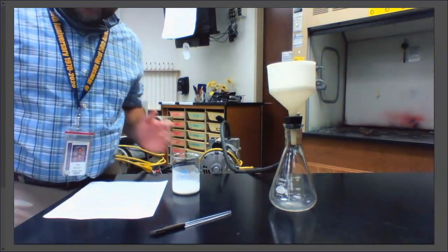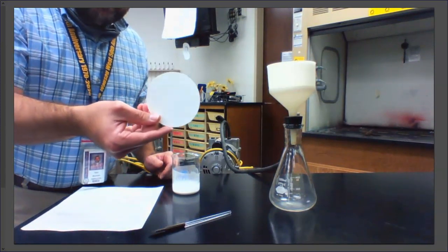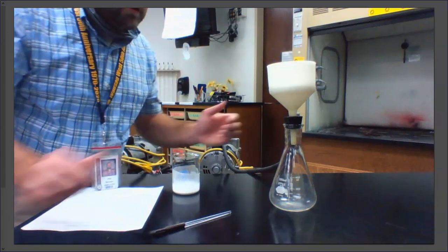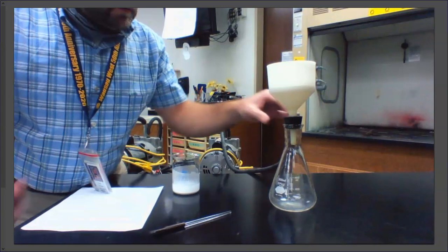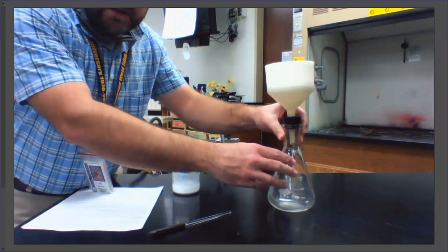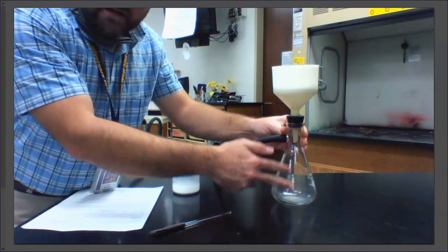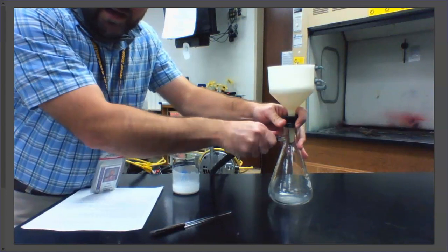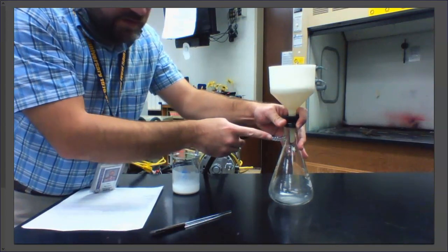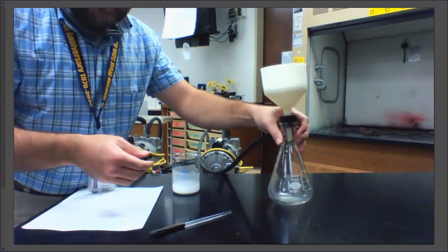If you were in the lab, we would absolutely need to record that as a part of this procedure. I'm then going to take my filter paper and put it in what is called a Buchner funnel. This funnel on top is put on what's known as an Erlenmeyer flask. Erlenmeyer flasks are the triangle-looking ones like this, but this is more specifically a vacuum Erlenmeyer flask. So there's this side port over here, which I can hook up to a vacuum pump.